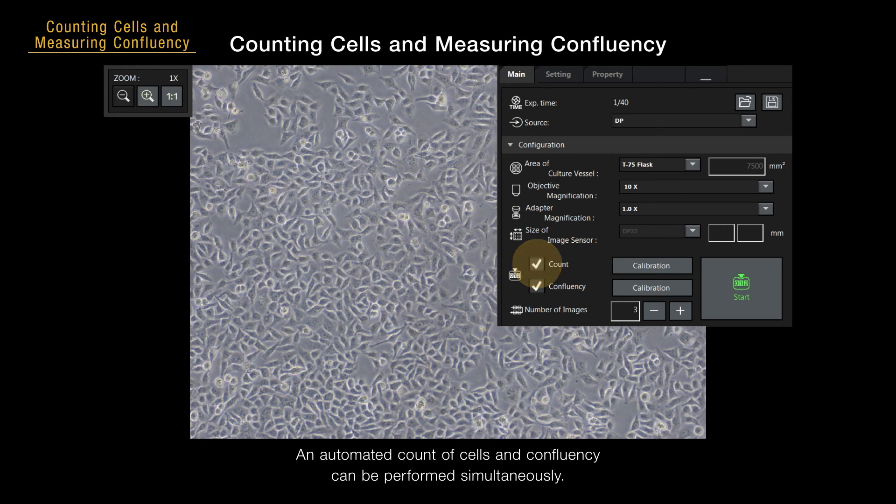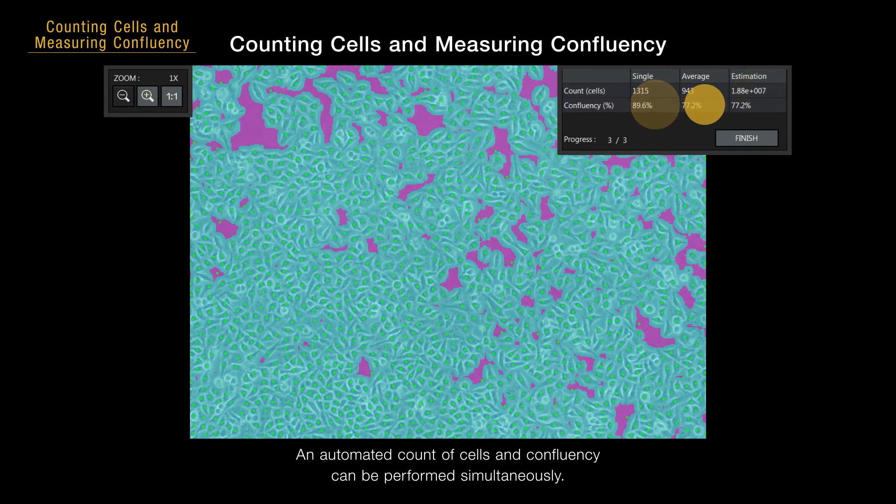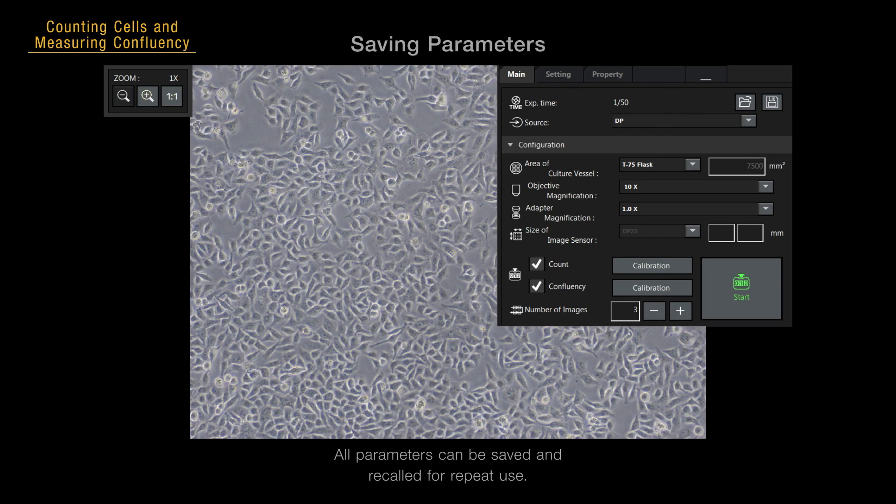An automated count of cells and confluency can be performed simultaneously. All parameters can be saved and recalled for repeat use.